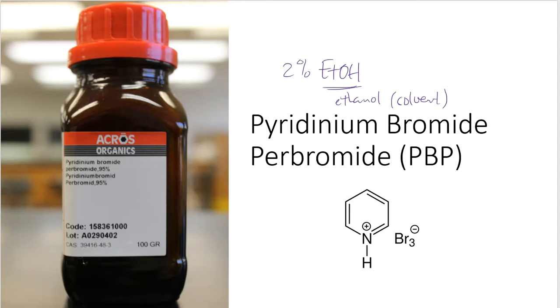All right, so I'm going to go to the balance. There we go. I'm going to tare it out. It's not perfectly 0. I'm okay with this, folks. It's not quantitative. It's qualitative. So as long as I ballpark it in the vicinity of what I need, then this test is going to work. That's the beauty of qualitative analysis.